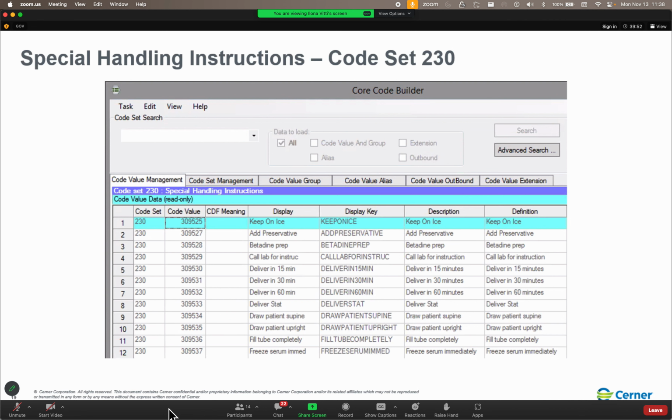Now, the group flag. Ooh, this has to deal with look-aheads. So there's a setting in the back end that we will go over in the troubleshooting chapter, where we say how far ahead should an immediate accessioned order look to invite other orders to join it.